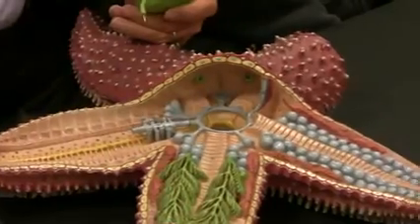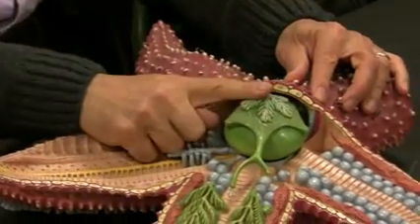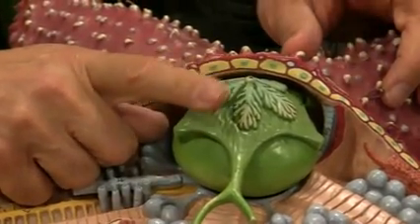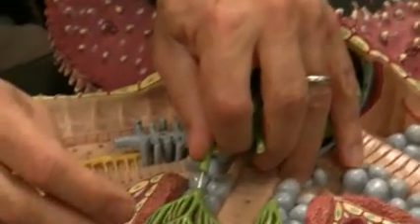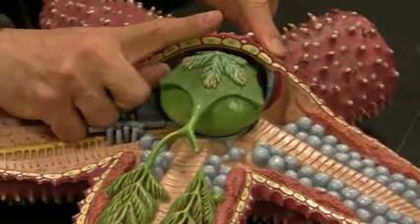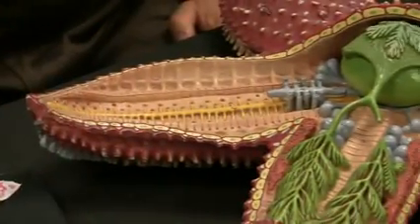The anus is on top. It's not on the madreporite. The anus is on top somewhere here, very small. Your textbook calls it inconspicuous, very small. Okay, so the anus is inconspicuous. That's the term your textbooks, and since my time, were using. But anyhow, this is the madreporite. The anus would be on top, so they do have an anus. Is this simple? No.